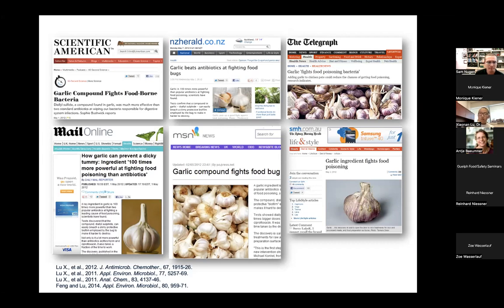So we used Raman and infrared spectroscopy for the first time to identify that those garlic-derived organosulfur compounds can freely penetrate through the bacterial cell membrane and the cell wall, and then combine with the thiol-containing enzymes inside the different pathogenic bacteria, including E. coli, Salmonella, and Listeria. And that's the reason how those sulfur compounds can inactivate the foodborne pathogenic bacteria.